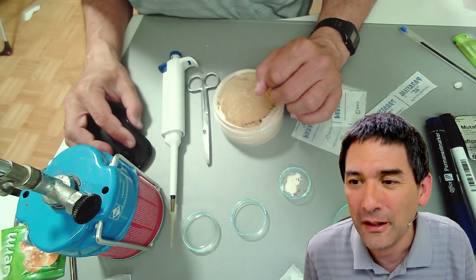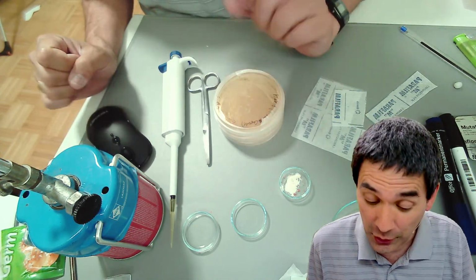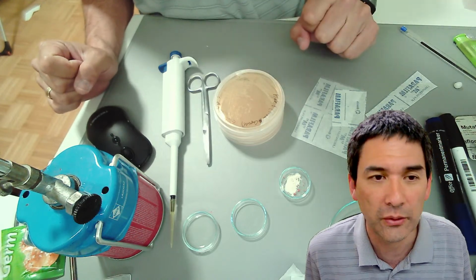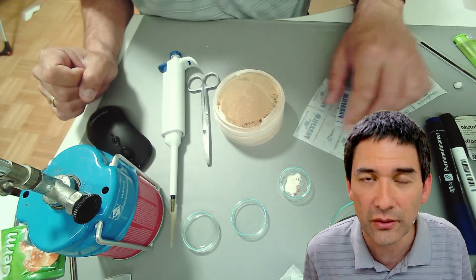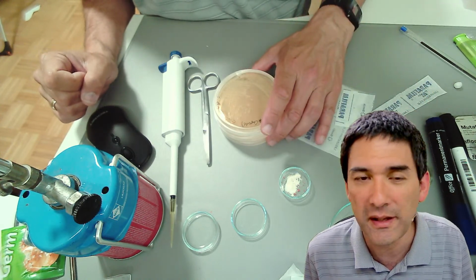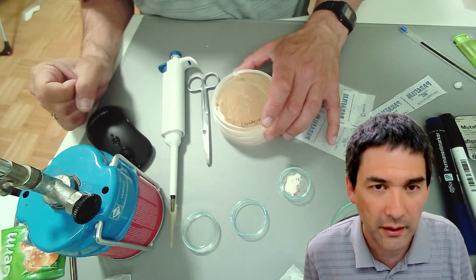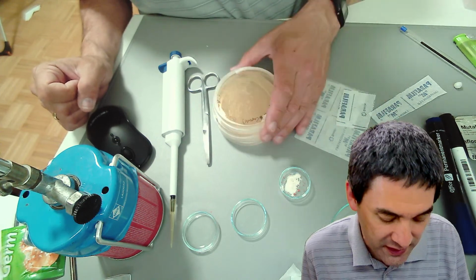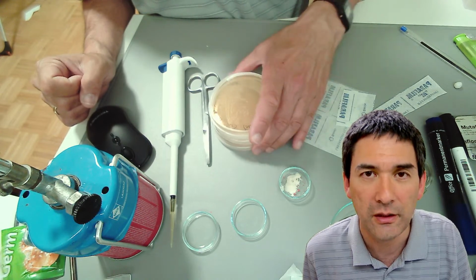So what I'm going to do is the following. Because I'm also starting to become a little bit tired right now, I'm going to leave it at that. I hope it was interesting, and that you got a short insight into some bacteria and basic microbiology today. In summary, it's not necessary if you're interested in microscopy to do these things, but I just thought that it might be interesting in any case.